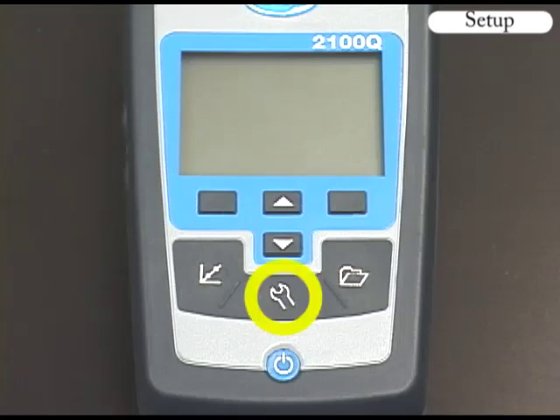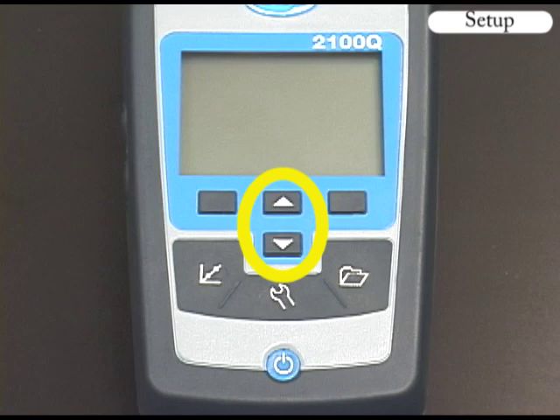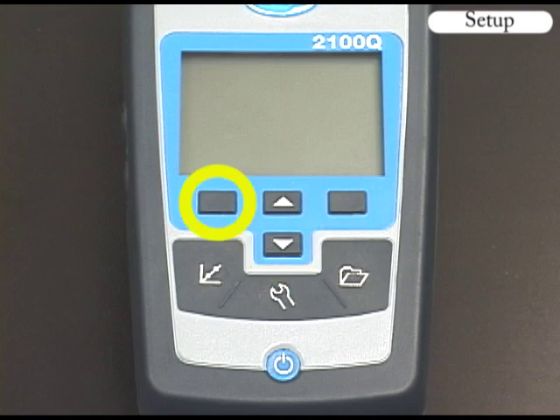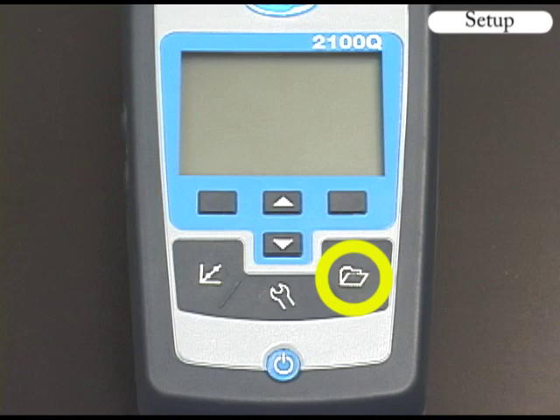This is the settings key used for meter setup. This is the calibration key. The up and down keys are used to scroll through menu selections and enter numbers and letters. The left key is used for calibration verification or to exit to the previous screen. The right key is used to read the sample, select options, and open submenus. The data management key is used to view, delete, or transfer data.